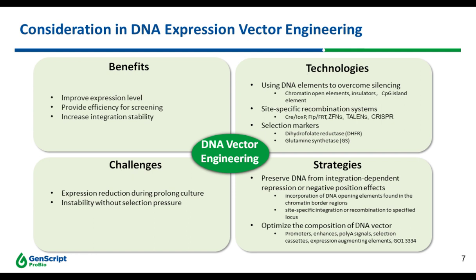So the engineering of the DNA expression vector should offer the benefit of improved expression level, provide efficiency for screening, and increase integration stability. The commonly used strategies are to protect DNA from integration-dependent repression or negative position effect, and also to optimize the composition of DNA vectors.